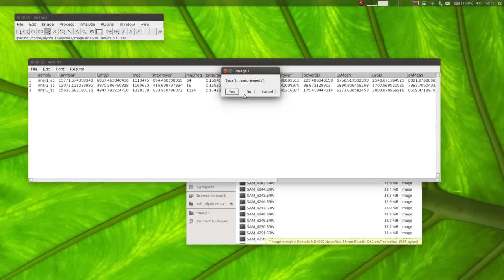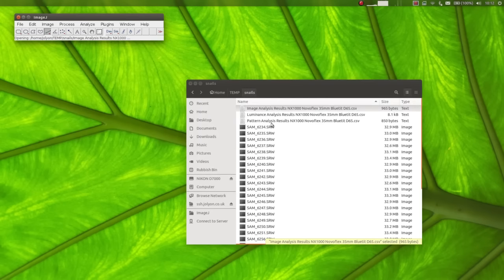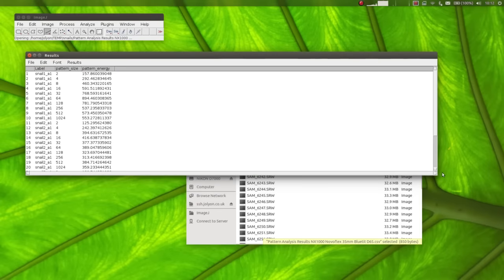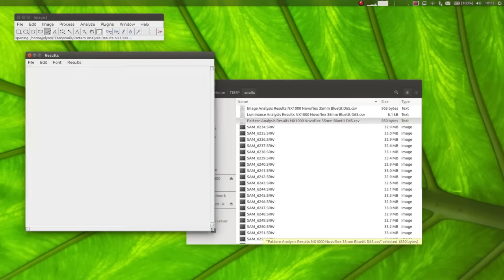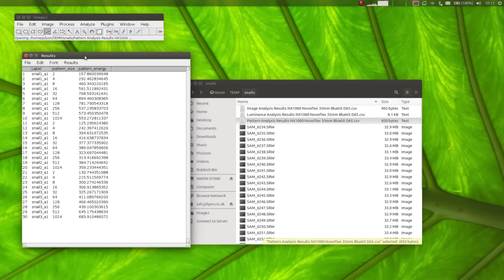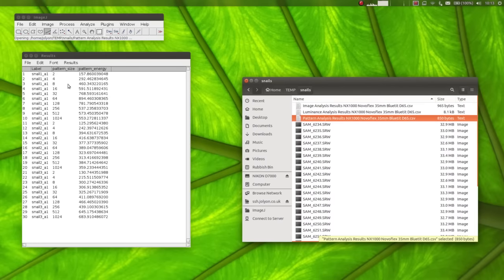They're the main descriptive statistics. Then if we look at the pattern analysis results here, it's showing these results because I chose to output the pattern spectrum results. Here is the pattern size in pixels after scaling to 70 pixels per millimeter, and the amount of energy at each scale is shown there.